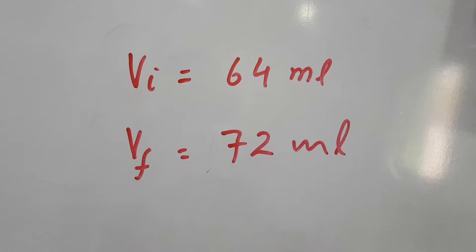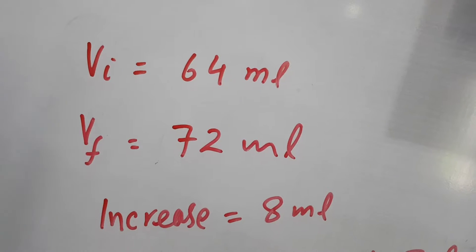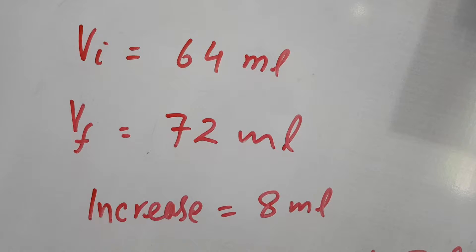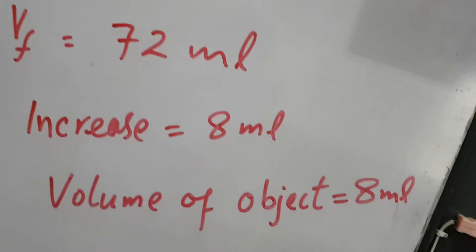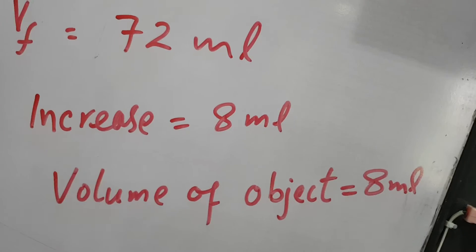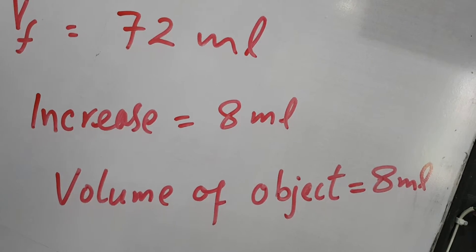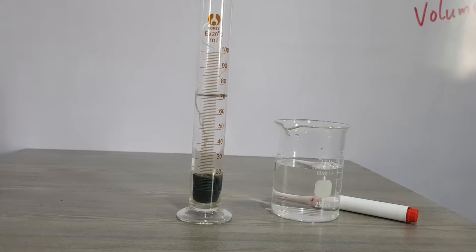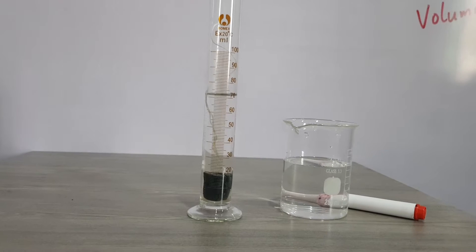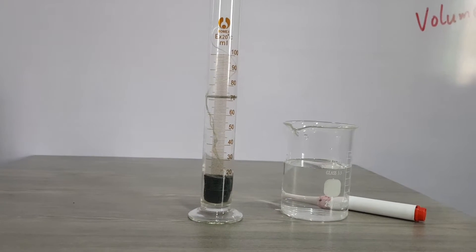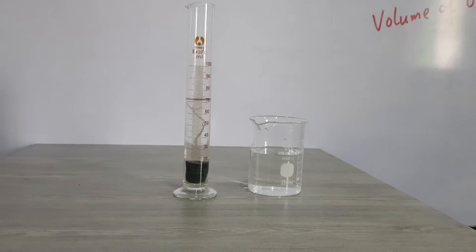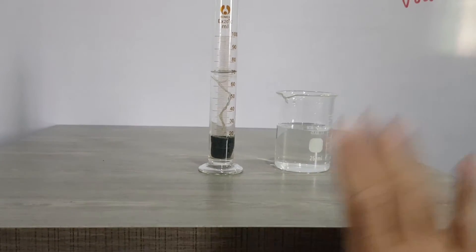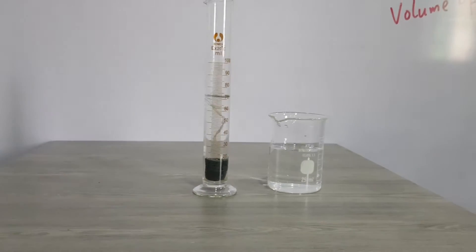How much did the volume increase? 8 ml. This 8 ml is the volume of the object we dipped into the water. You have learned how to find the volume of an irregular shaped object with the help of a measuring cylinder. Some precautions: first, the surface should be plain and leveled, and the cylinder must be kept on a leveled surface vertically.